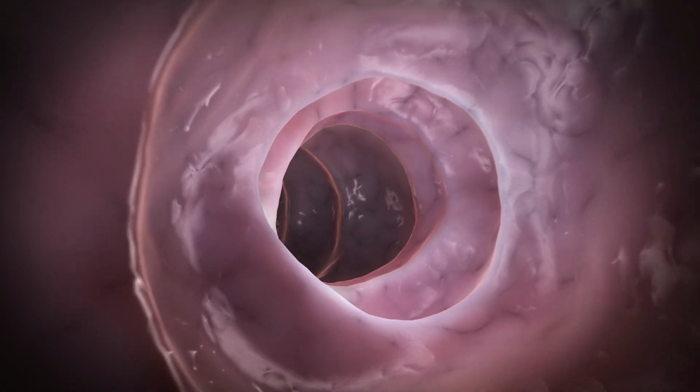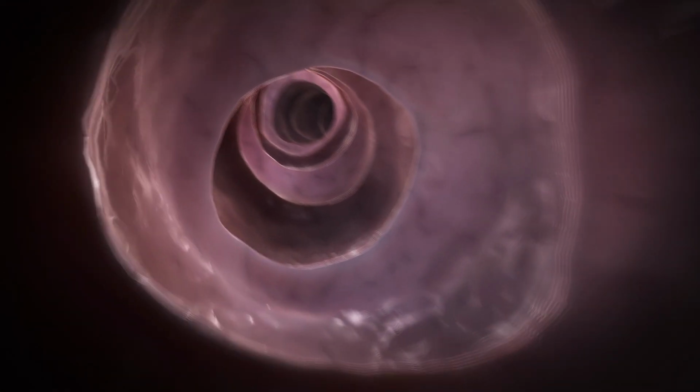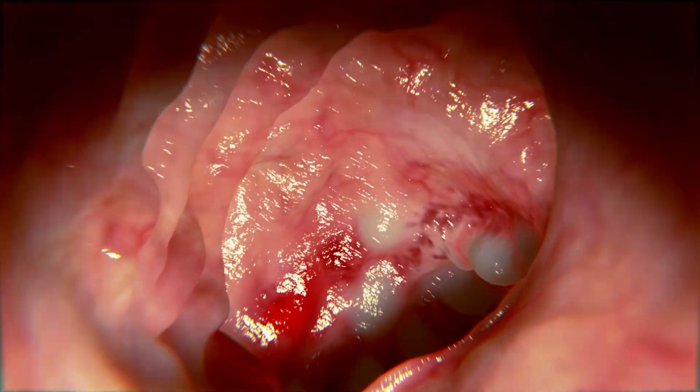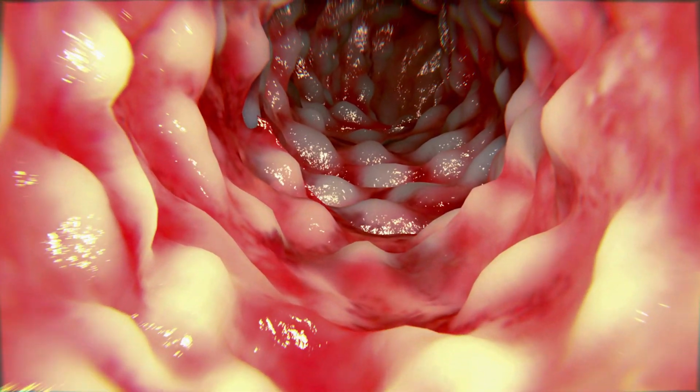Using the human organ chips, we were able to generate a mucus layer in vitro similar to that found in the human colon. This has never been done before. And the mucus layer in the human colon protects the intestinal epithelial cells from inflammatory stimuli such as pathogens or irritants. In patients with inflammatory bowel disease, it has been shown that there are defects in the mucus layer. Understanding this could help us understand how this disease develops and what could be done to cure these patients.